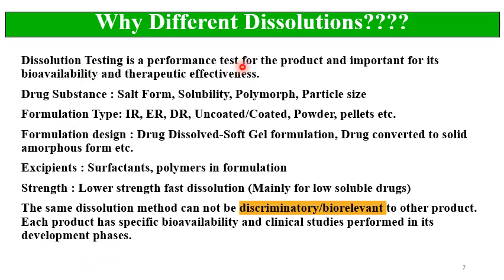Dissolution testing is a performance test for the product and is important for its bioavailability and therapeutic effectiveness. See, the dissolution method is not a simple method of testing like assay or water content, because dissolution is a performance test and each product has different performance.